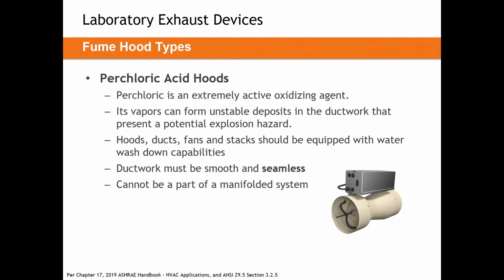It's not like hydrochloric or sulfuric or bromic acid, more common types of things we'd see in a laboratory. Perchloric acid gets its own special place in all of these guides and standards. And it's not so much about the hood, it's not so much about the valve, it's about the acid itself. Perchloric acid is an extremely active oxidizing agent.